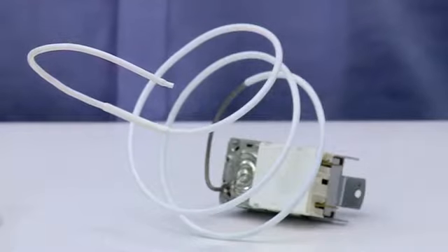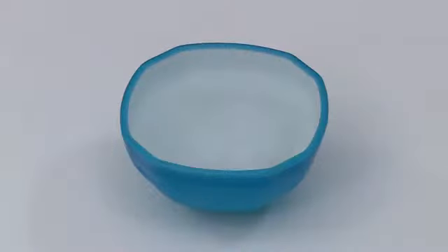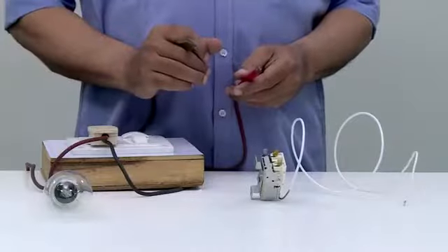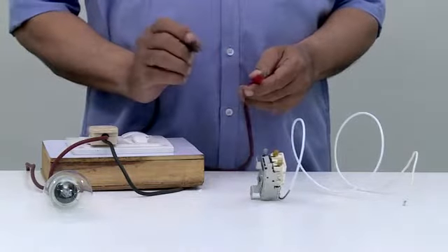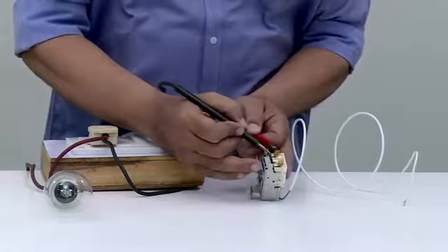Let's test the mechanical thermostat. For its testing, we require a powered test lamp and crushed ice in a bowl. As we check, continuity in this thermostat contacts is present as the bulb glows.